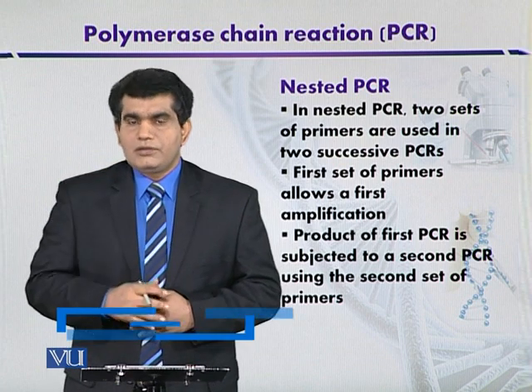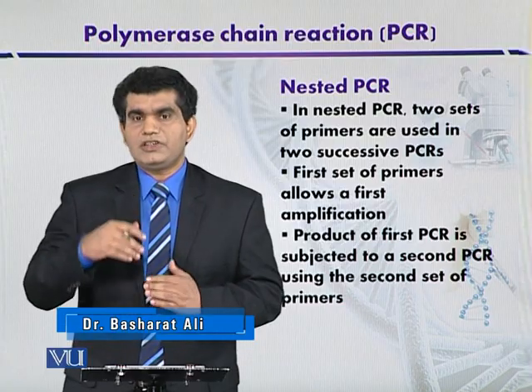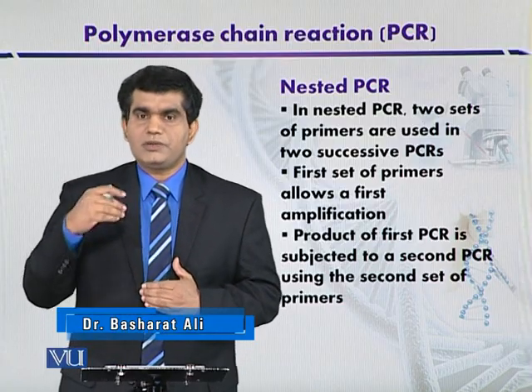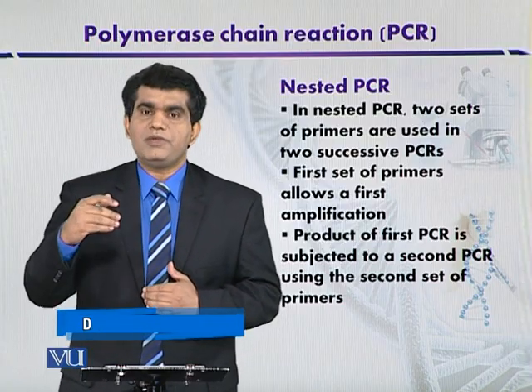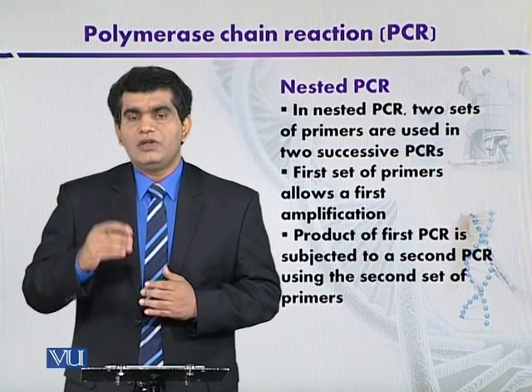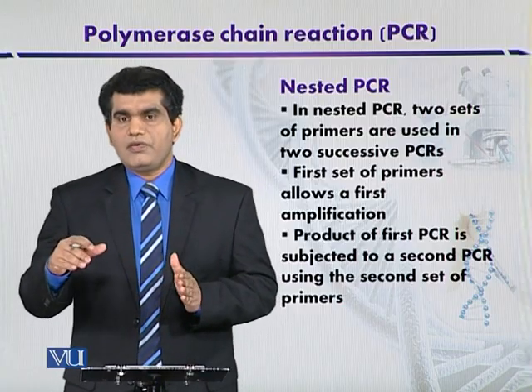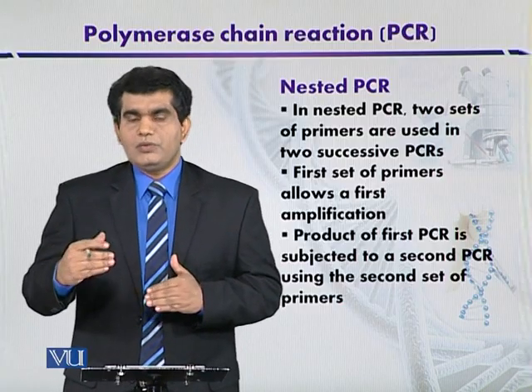The product that is generated from the first reaction is subsequently subjected to a second PCR reaction. And for the second PCR, we use a second set of primers to amplify the DNA molecule that is generated from the first PCR.